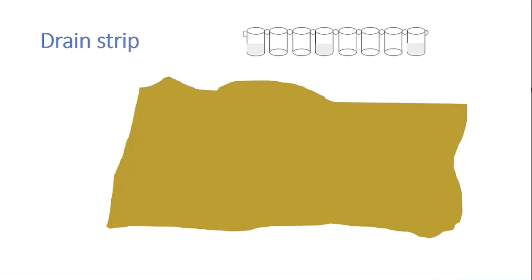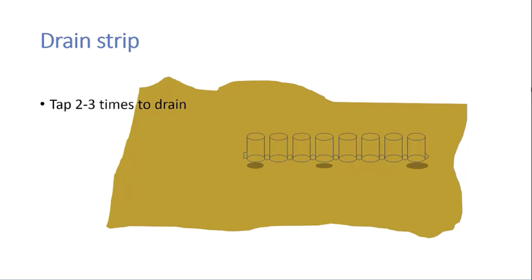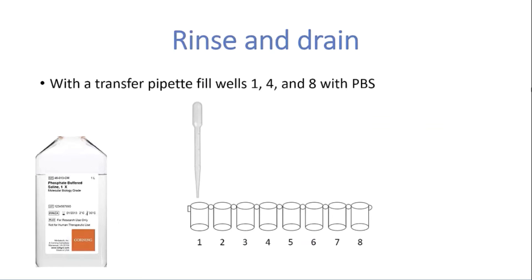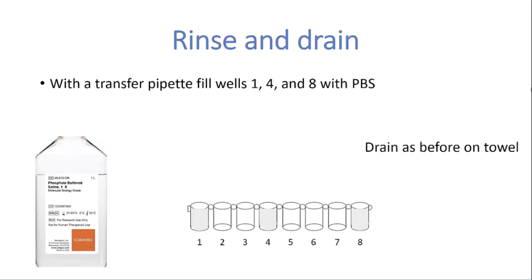After 5 minutes, the liquid in the strip is drained by flipping the strip over on a paper towel on the bench and tapping it 2 to 3 times. The wells are then washed with phosphate buffered saline: using a transfer pipette, fill wells number 1, 4, and 8 with PBS, then drain as before on a paper towel. Repeat the rinse and drain again.